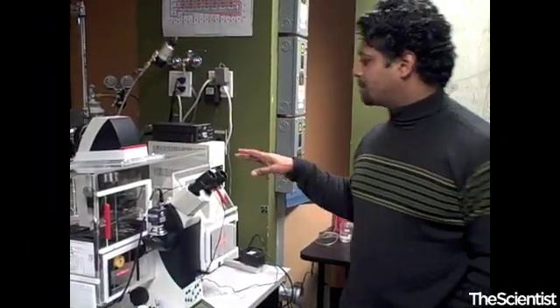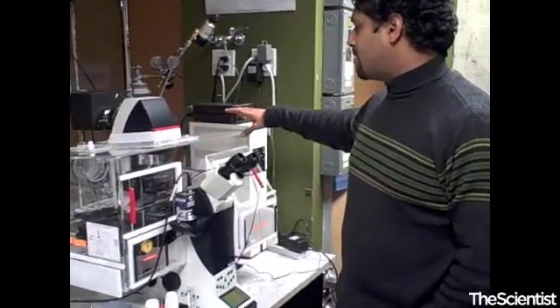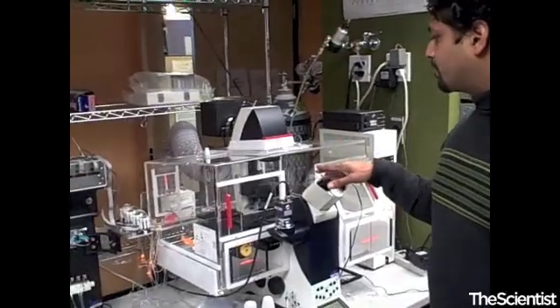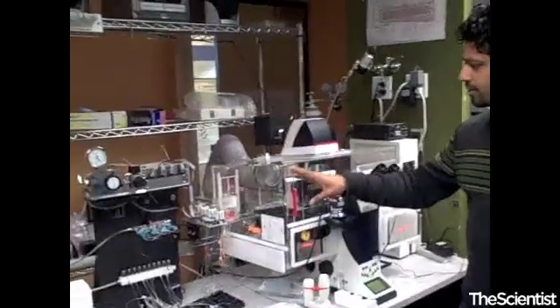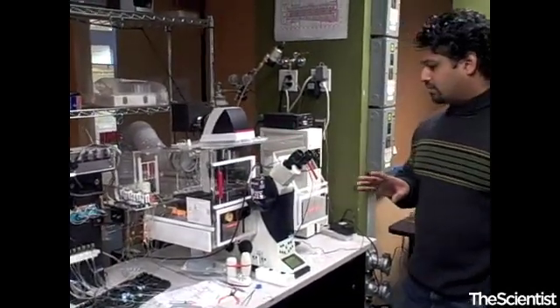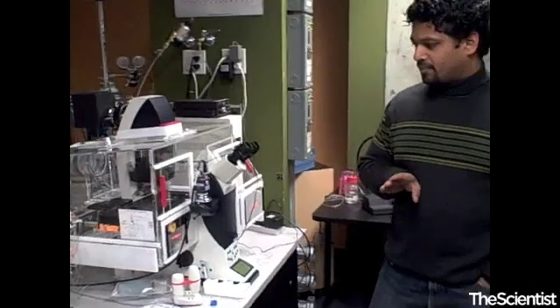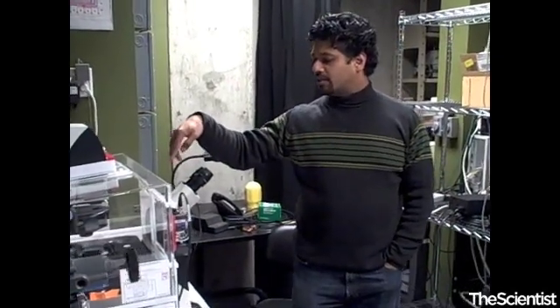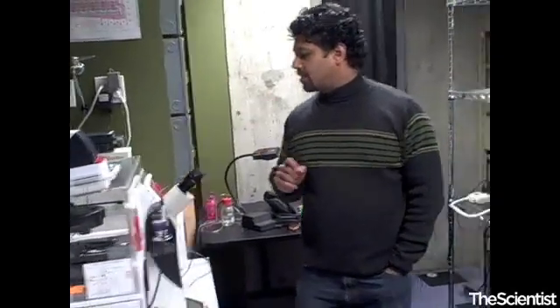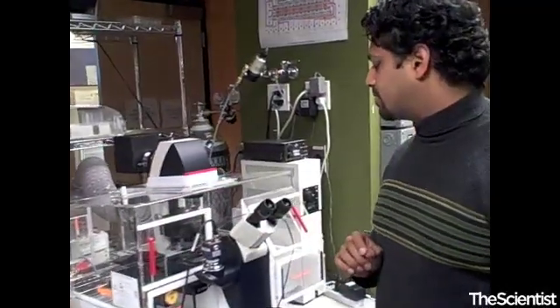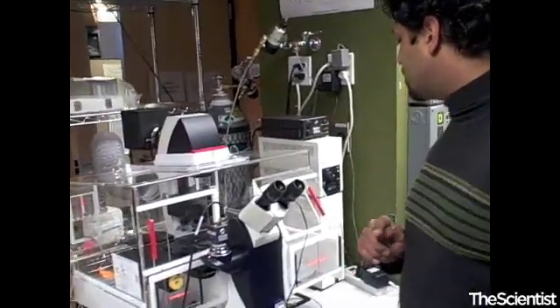This is a microscope with an incubation chamber built around the microscope stage, and it's connected to a fluidics control system with valves that are programmed and modulated with computer programs. We can place chips in the chamber under the microscope objective and modulate the cell culturing using the microfluidics devices and the valves.